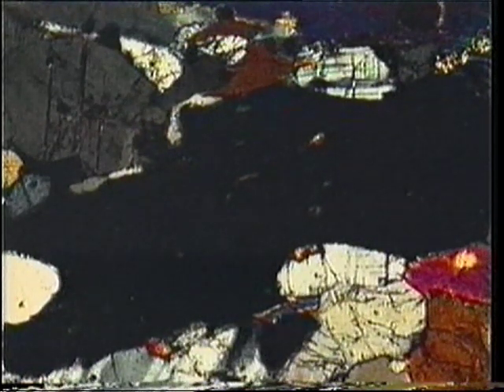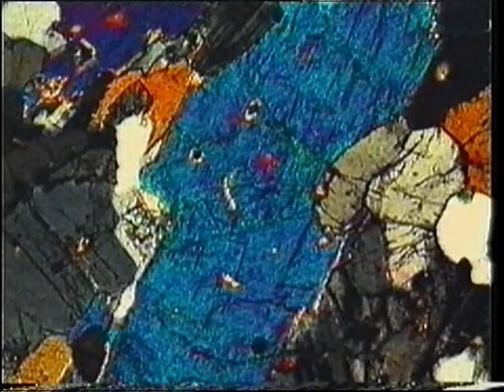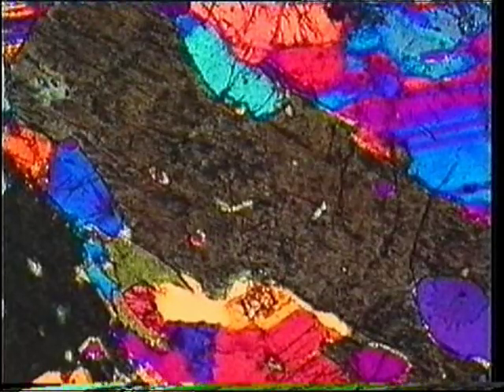Rotate the dark green vibration direction northeast-southwest. Plate in, and the interference colours seem to rise to third order blue. Rotate 90 degrees to check, and the interference colours fall to almost black. Rotate back. That's definitely a rise, so the northeast-southwest vibration direction is Z.